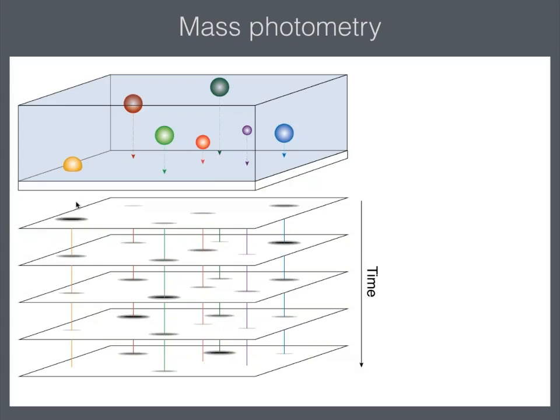So what you see is molecules that weren't visible in the first frame. Let's say this dark green one here was too far away from the surface to be detected in the initial frame, but starts to appear over time, ultimately giving rise to a strong contrast in this 5th frame here.